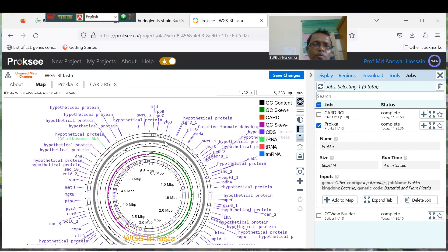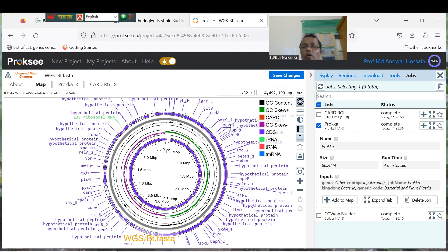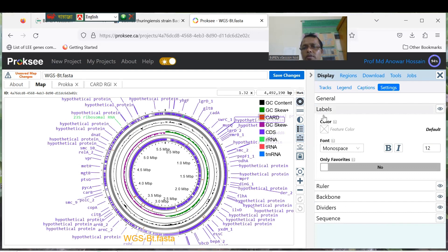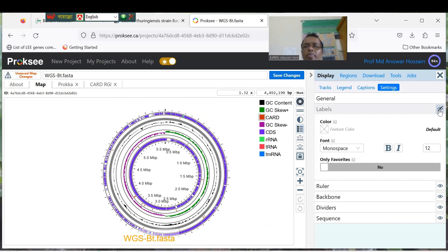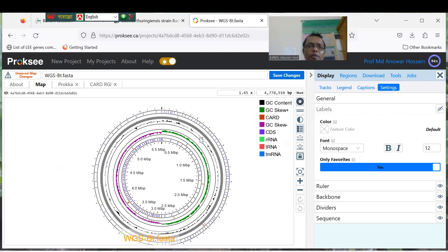Prokka has already worked on that and these are the resulting maps. Prokka has discovered all the genes in your genome. To prepare and display the map, just go to Settings. You can manage labels — click visibility to close them so all the labels are hidden. Then only the favorites are shown. If you want to add specific expected genes to show in the map, you can do so.